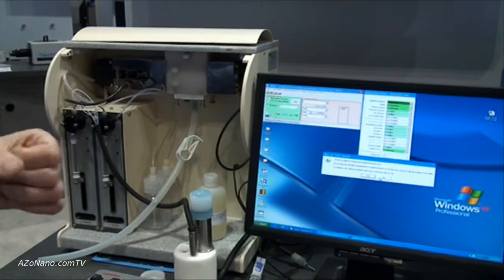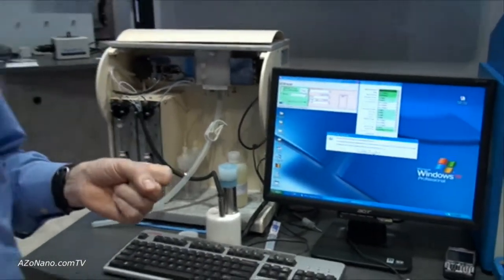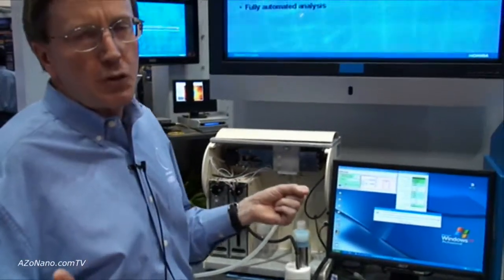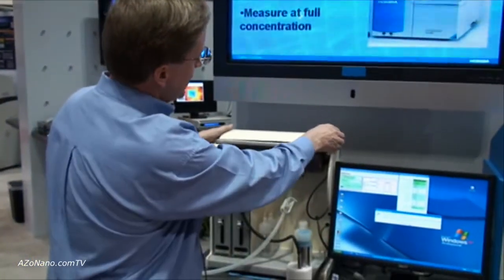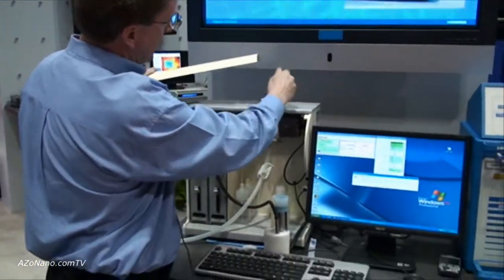So let's say we're making titanium dioxide or alumina down in the nano material range. Let's say we're going to measure alumina that's down at 100 nanometers. All that's involved here is we're just going to take the sample and pour it into the chamber.